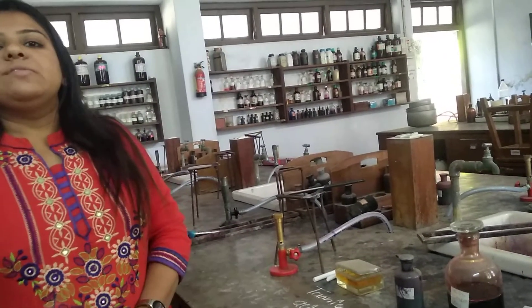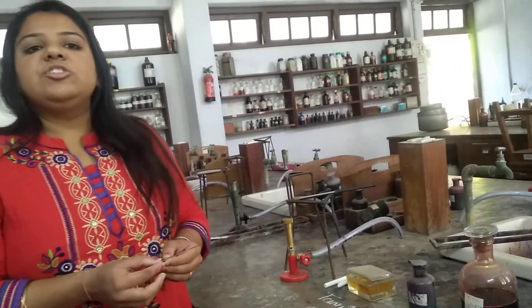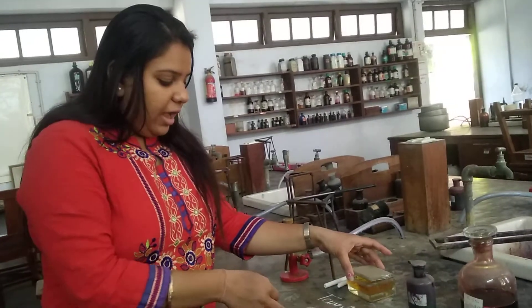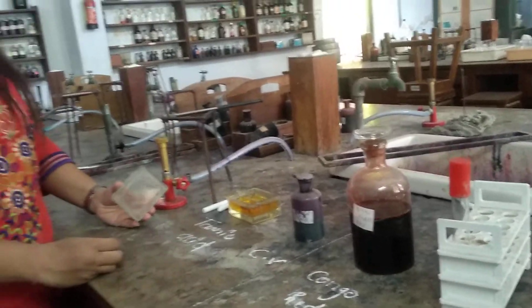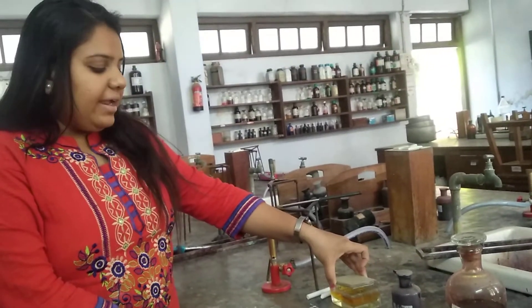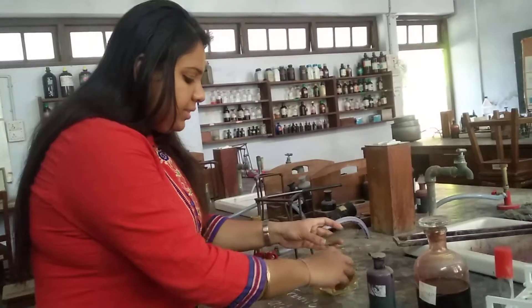Now, after some time, we will dip this particular slide, which is heat fixed, into the tannic acid solution. Here you can see that the tannic acid is there. We have to keep the slide for a minimum of 30-60 minutes. I have already prepared the slide and placed it in the tannic acid solution, so now we will continue with that slide.